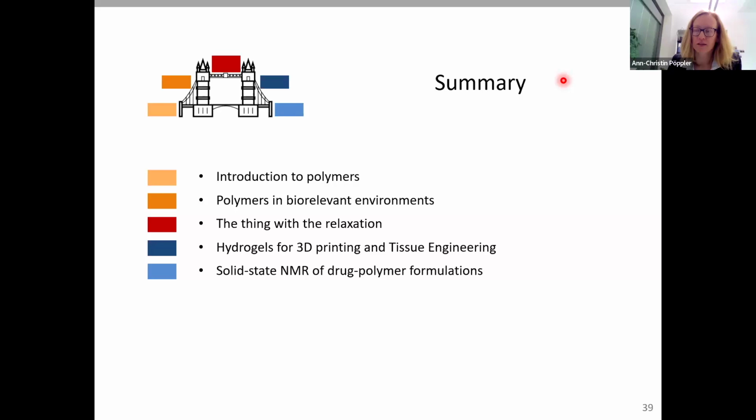But that's a hurdle, that many of the signals are strongly overlapping, let's say, in the middle region of the spectrum. I hope that answers. Otherwise, just add a second question to that.